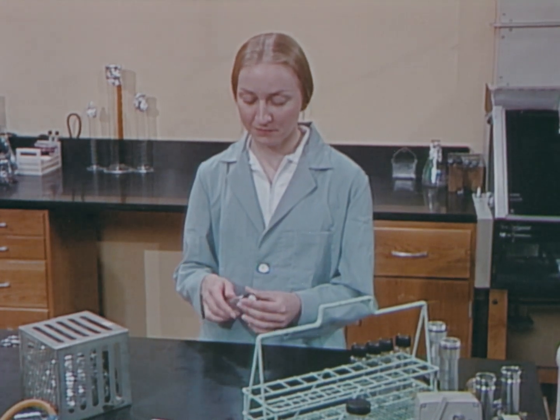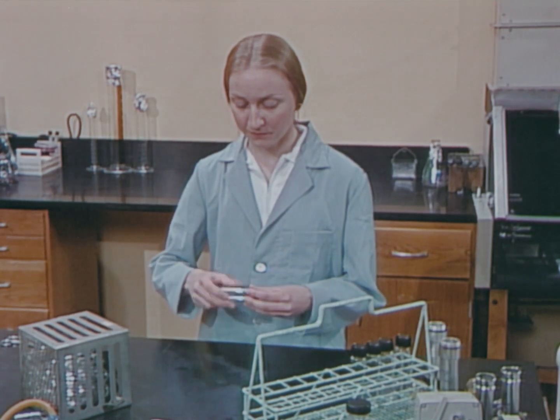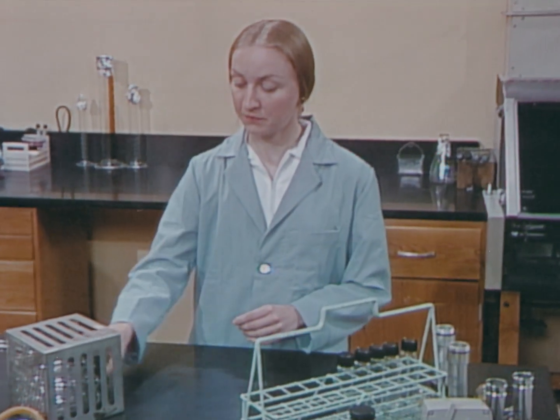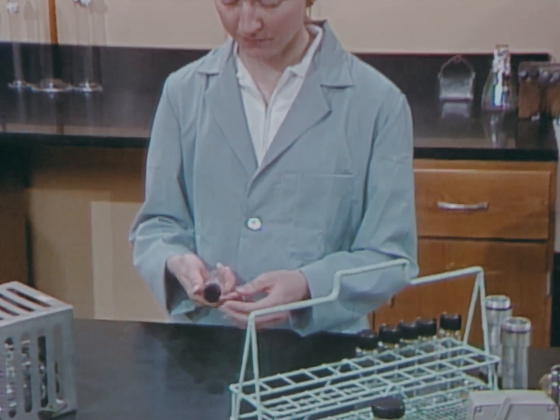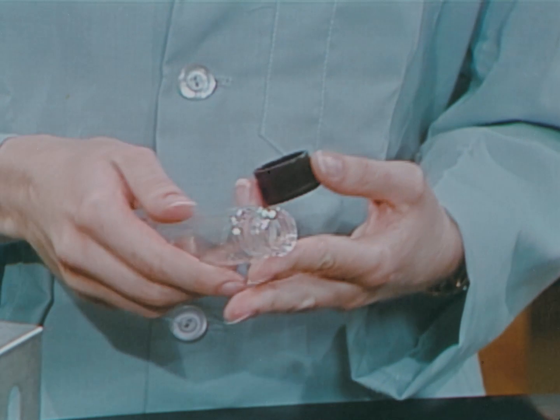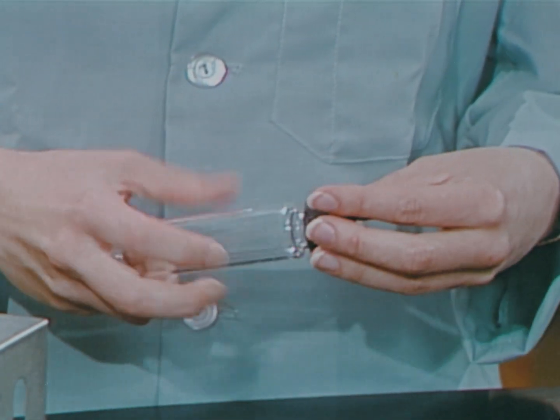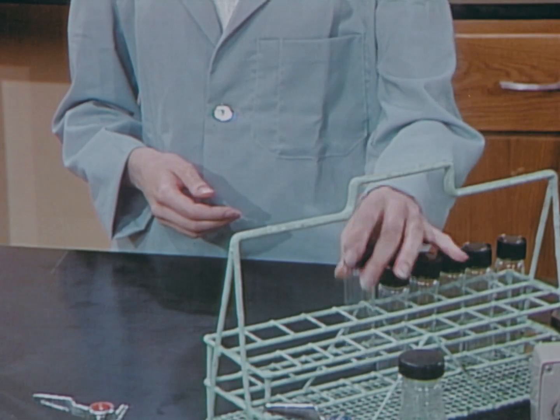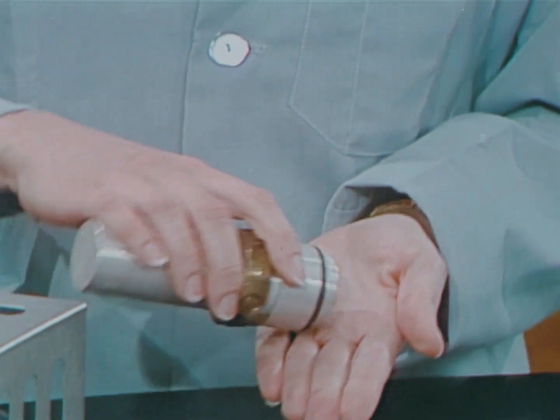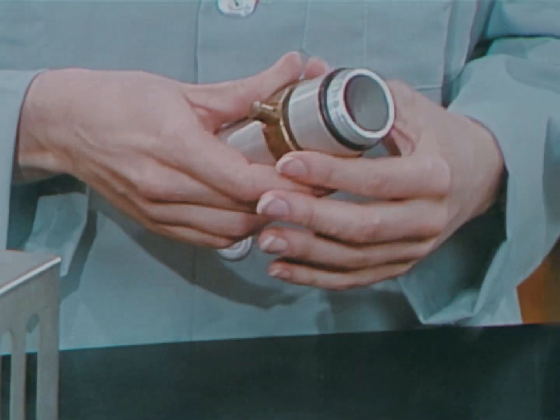Precautions must also be taken when working with a centrifuge. You can minimize the likelihood of droplet nuclei being released from broken tubes by doing the following. First, inspect each tube to be used. Be certain there are no chips or cracks. Inspect the carriers in the centrifuge head. Be sure carriers are clean and that mountings are secure.